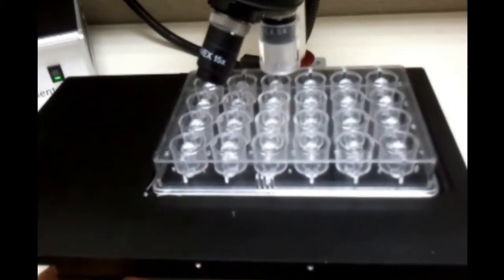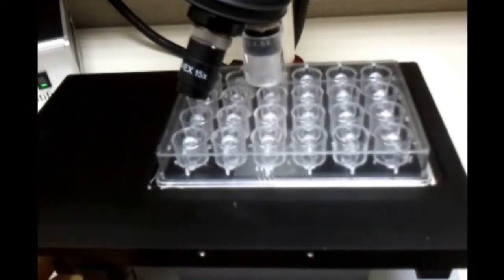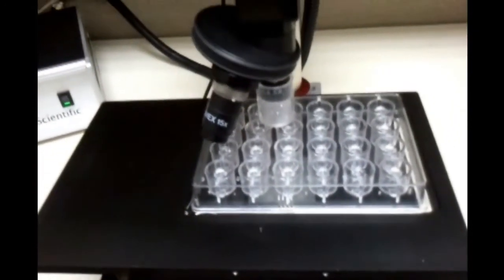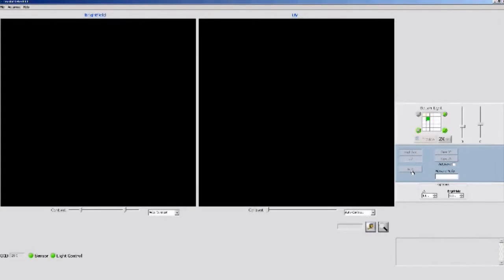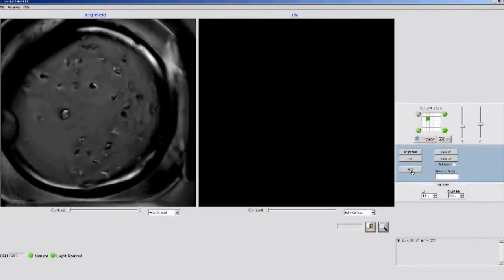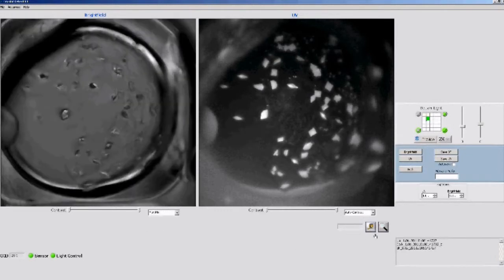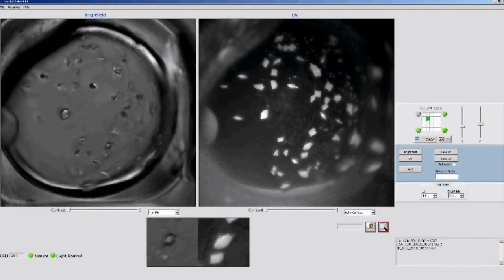Here is the manual version. The difference from the motorized version is just the fact that this has a manual stage, and it is missing the controller box for this stage. It is the same in every other respect. The UI for the manual version is also very much like the one for the motorized version, except for the fact that the plate configuration is missing. The operation and functionalities are the same in the two versions.